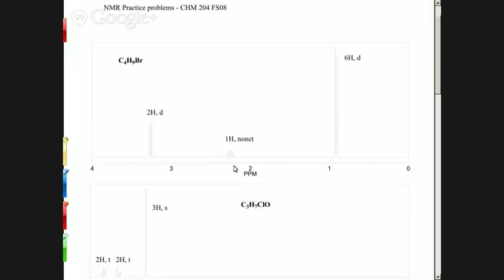You could have 3 CH2s, but that again would be difficult because they'd all have to be exactly symmetrically the same. There's an even better choice than that. Yeah, 2 CH3s. So a group of 6 could be 2 CH3s connected to 1 carbon, then those would be indistinguishable from each other. Not connected to each other, because that doesn't allow you to connect to anything else. But the way you have it drawn there, it looks like they're connected to each other. Oh, okay. And then it doesn't leave any room for anything else. So really, it should be two CH3s connected to something else.